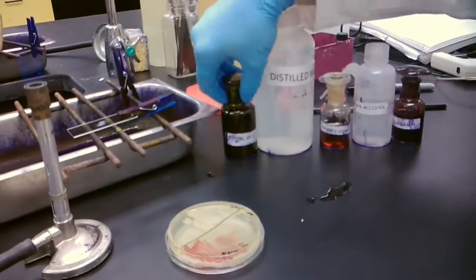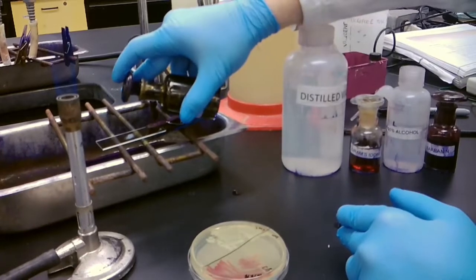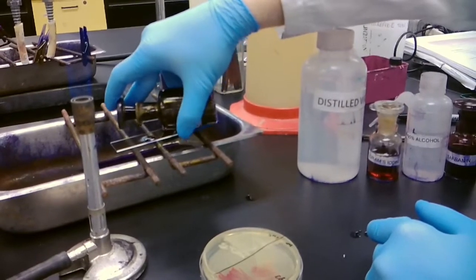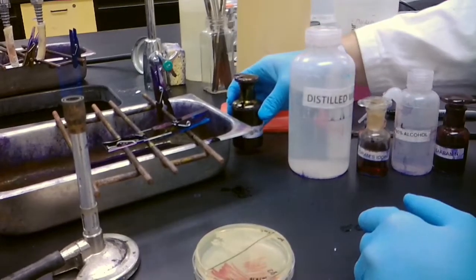So now, as before with a simple stain, you're going to take some crystal violet, put it onto your smear, and let it sit for about 30 to 60 seconds.